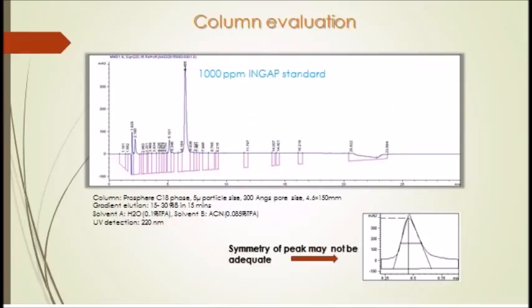Now, one of the first things I'm doing, actually right now, just starting the HPLC instrumentation the past couple months, is testing columns for efficiency and integrity. You have to choose a column out of a bunch of these from a drawer. I'm using a purified INGAP peptide as a standard in this testing.